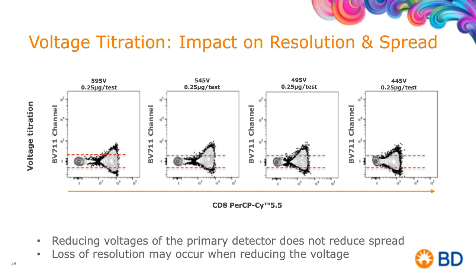Again, a fundamental, and individuals try it sometimes on their flow cytometers, but there's not a drastic reduction here. So we kind of get a double negative impact because we just lowered the voltage, but we reduced the resolution, and thus the separation between a positive and negative can be more than what we really wanted.